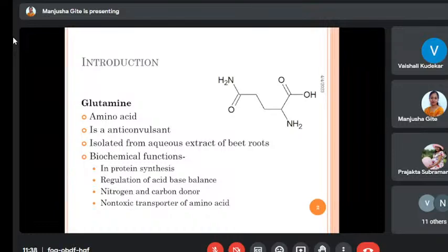Sir, the number of hydrogen atoms present with the nitrogen. What about the range of amino group? Around 3200 centimeter inverse, and in case of secondary amines you will get... In primary amines you will get 2 peaks, whereas in secondary you will get a single peak, and in tertiary you will not observe this absorption at particular wavelength.